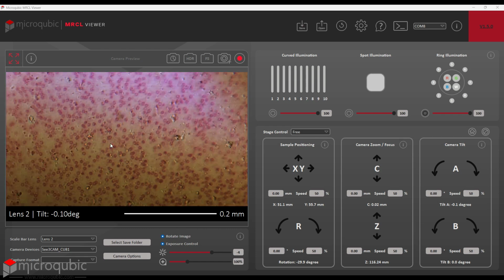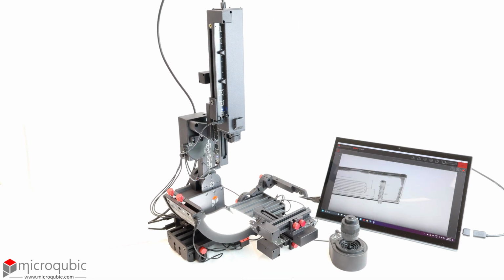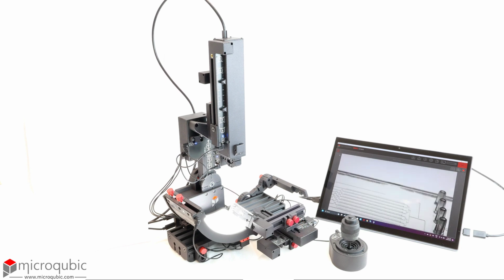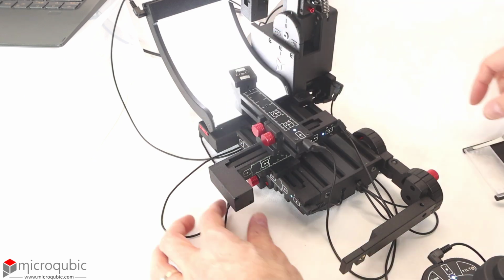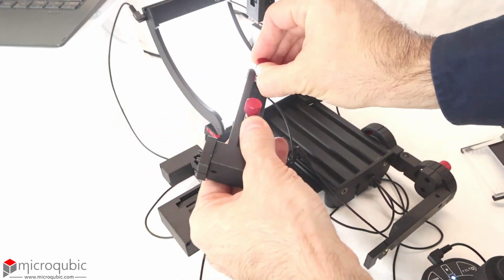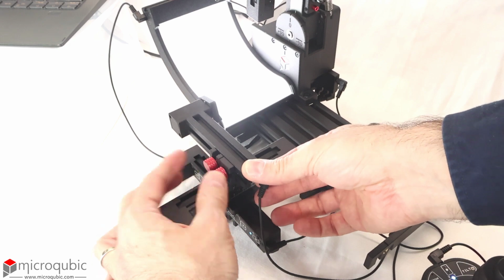So far, we have discussed imaging in transmitted light and reflected light modes using camera tilting. But this microscope has another feature that allows you to tilt the sample instead of the camera to capture 360-degree videos of the sample. First, extend the XY stage by pulling it out from the thumb screw underneath. Then, unscrew the rotary actuator, slide in the screws on the other side, and fix it back 90-degree rotated.